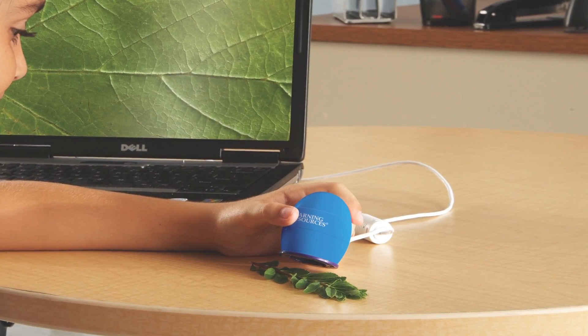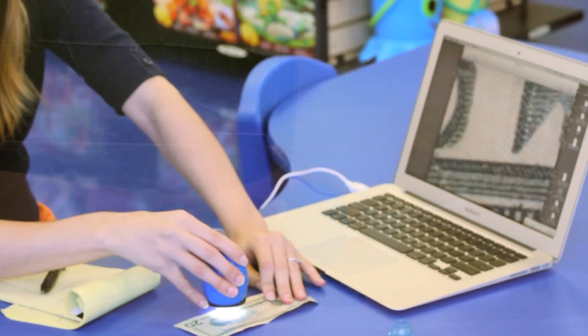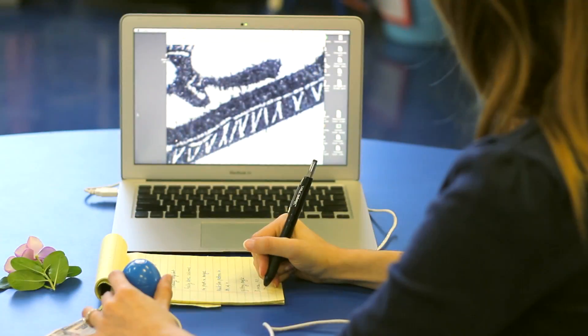Zoomie is just the right size for a child to hold with one hand, leaving the other hand free to manipulate objects or take notes.